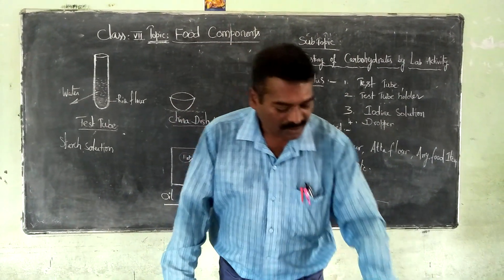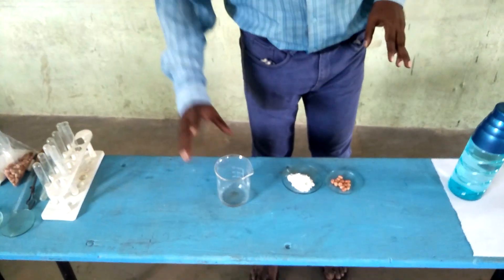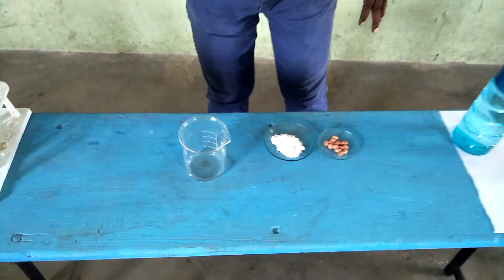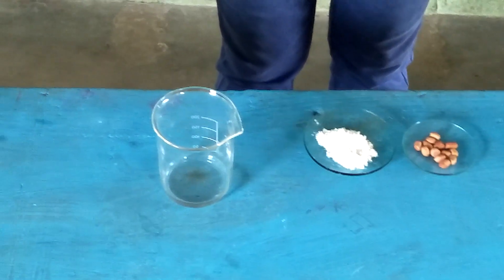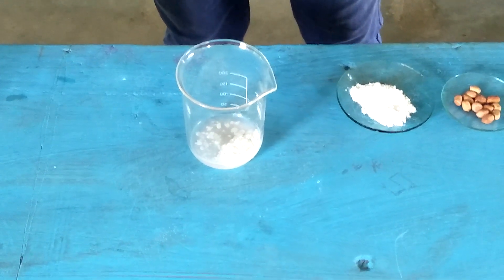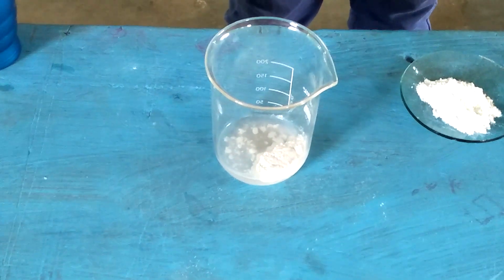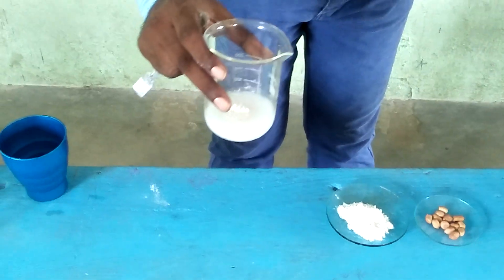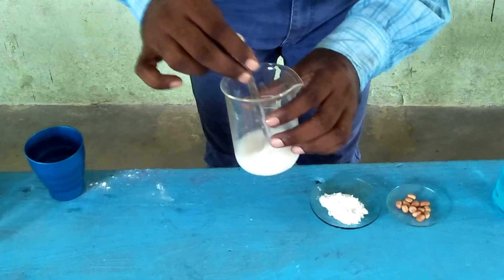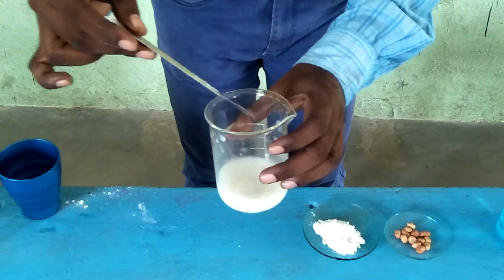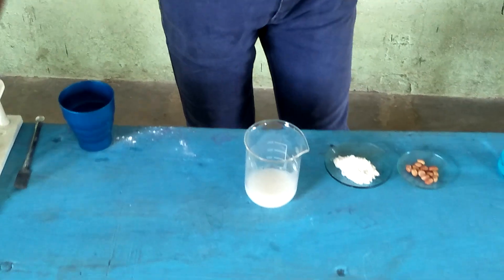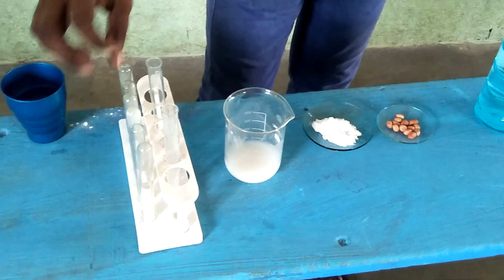First of all, take one beaker. In that beaker, add one or two tablespoons of rice flour or atta — whatever is available — and mix it properly by slowly adding water to prepare the starch solution. As we discussed in previous sessions, starch solution has a rich content of carbohydrates. Uniformly mix it properly using a spatula and keep it aside.